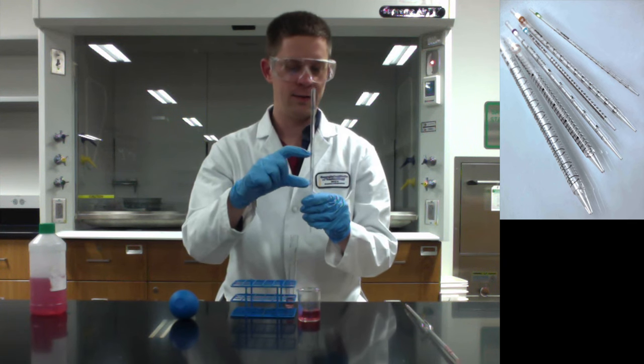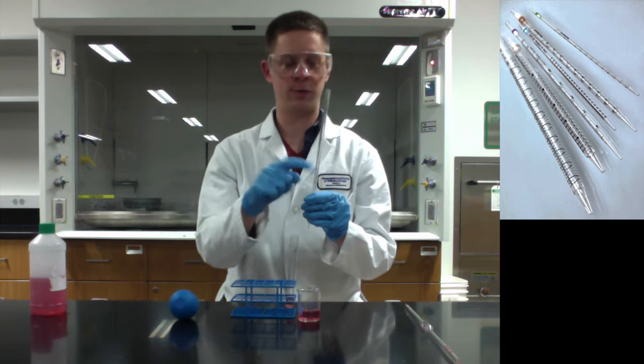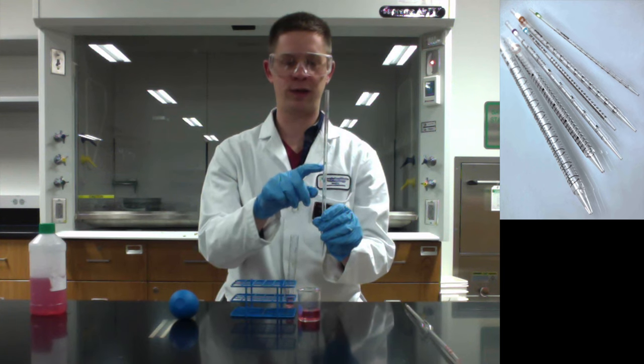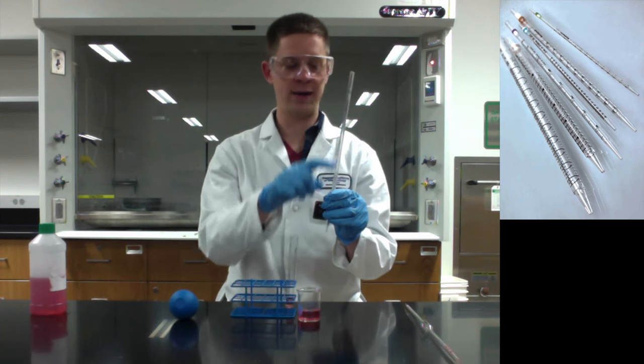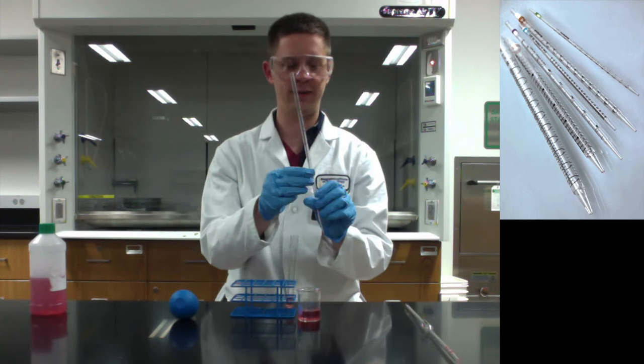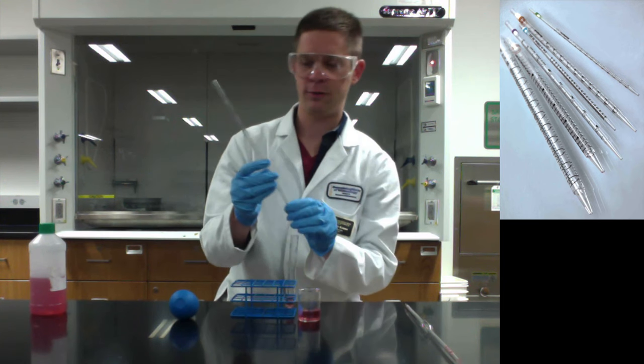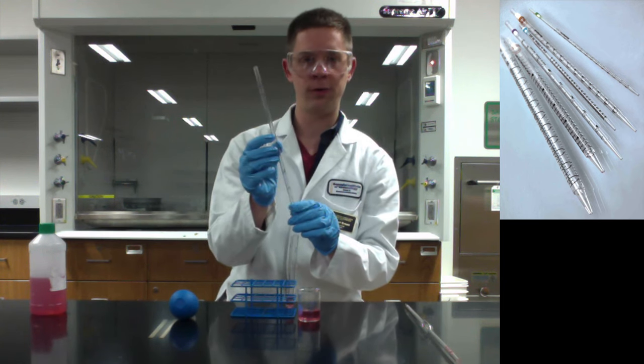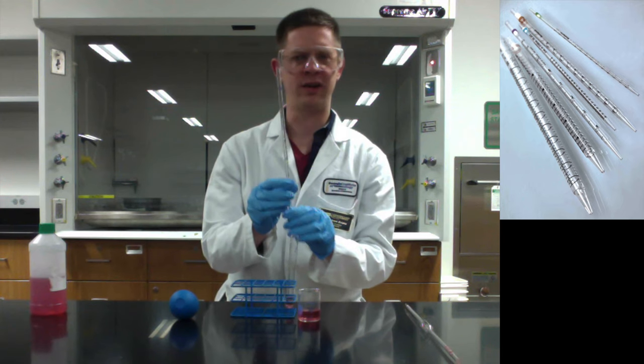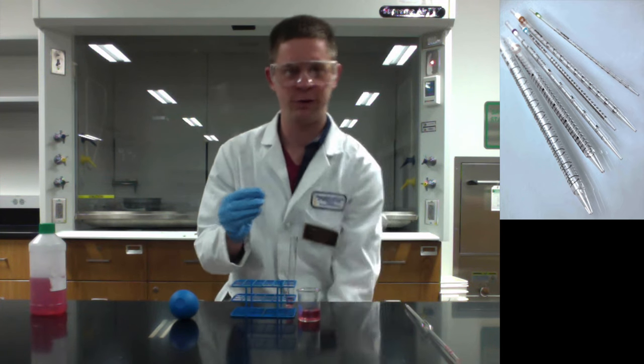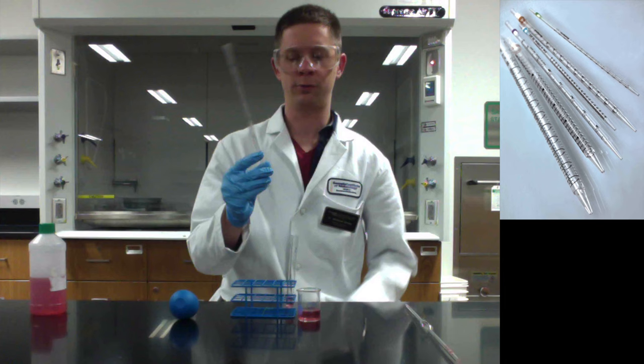This is sort of a volume measurement by difference, right? We pulled up to the zero line and then squirted out until we got down to the 2.6 line. You'll notice on many of these serological pipettes, and this one is no exception, that there are also numbers counting down from the top in a manner that you're probably a little more familiar and a little more comfortable with. And you can use these to pipette as well.